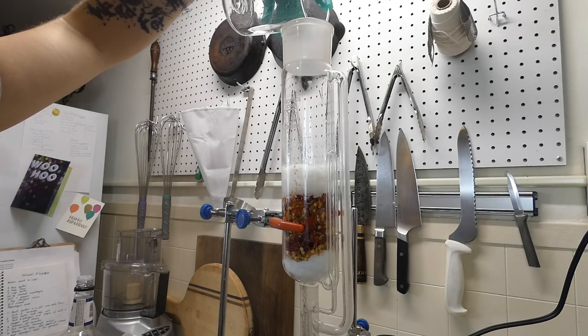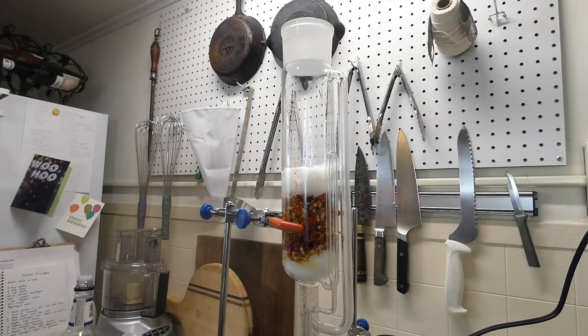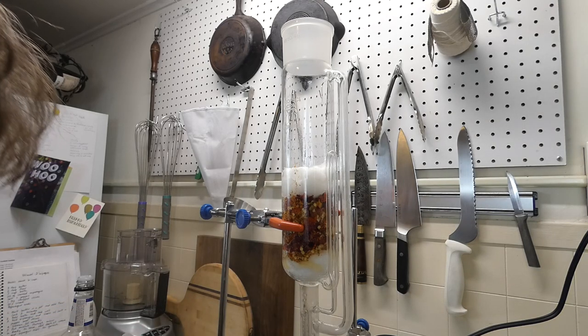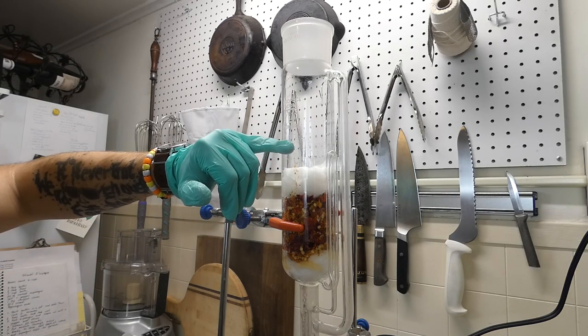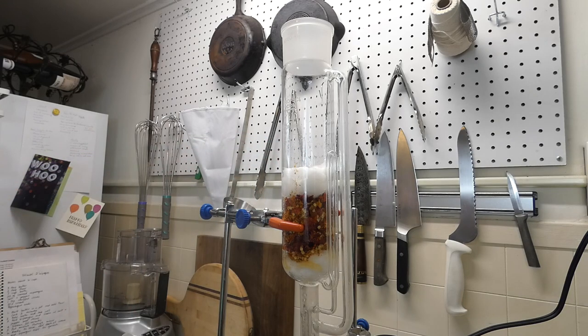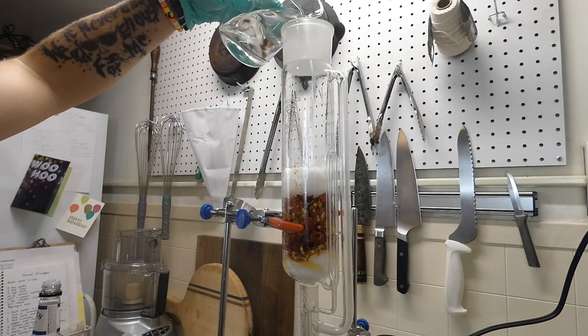And you'll see it's starting to run down, collecting at the bottom. You can see the color changing down here. That's what we like to see. That means it's already starting to extract. So what we want to do, we want to bring up the liquid to right about just under that level there. Let's put 200 more milliliters in this, and then we'll start the extraction.